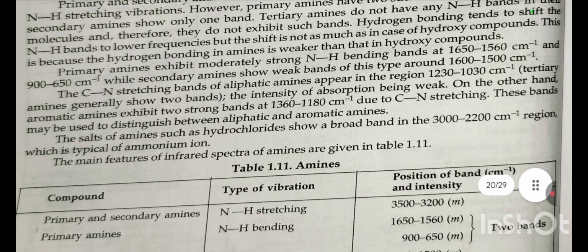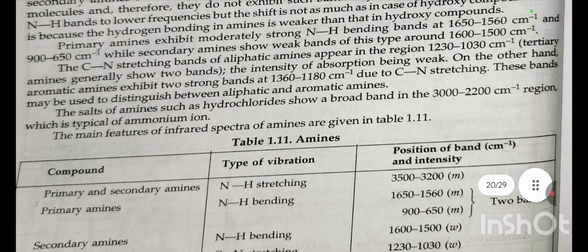The CN stretching bands of aliphatic amines appear in the region of 1230 to 1030 cm⁻¹. Tertiary amines generally show two bands, the intensity of absorption being weak. On the other hand, aromatic amines exhibit two strong bands at 1360 to 1180 cm⁻¹ due to CN stretching. These bands may be used to distinguish between aliphatic and aromatic amines.